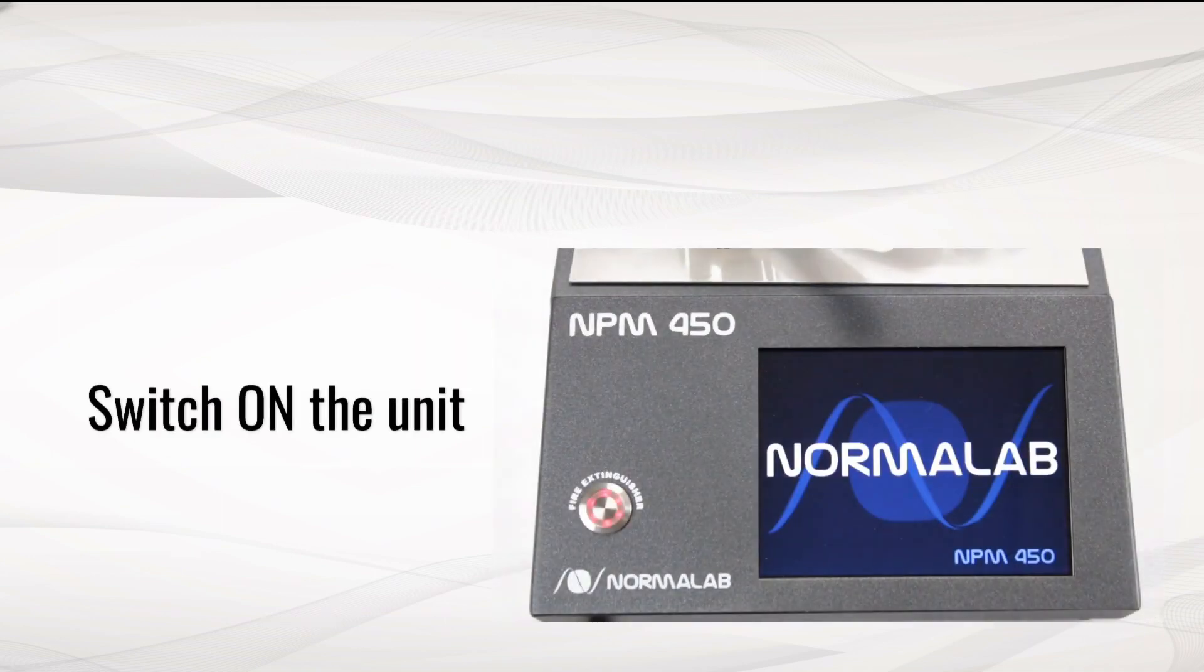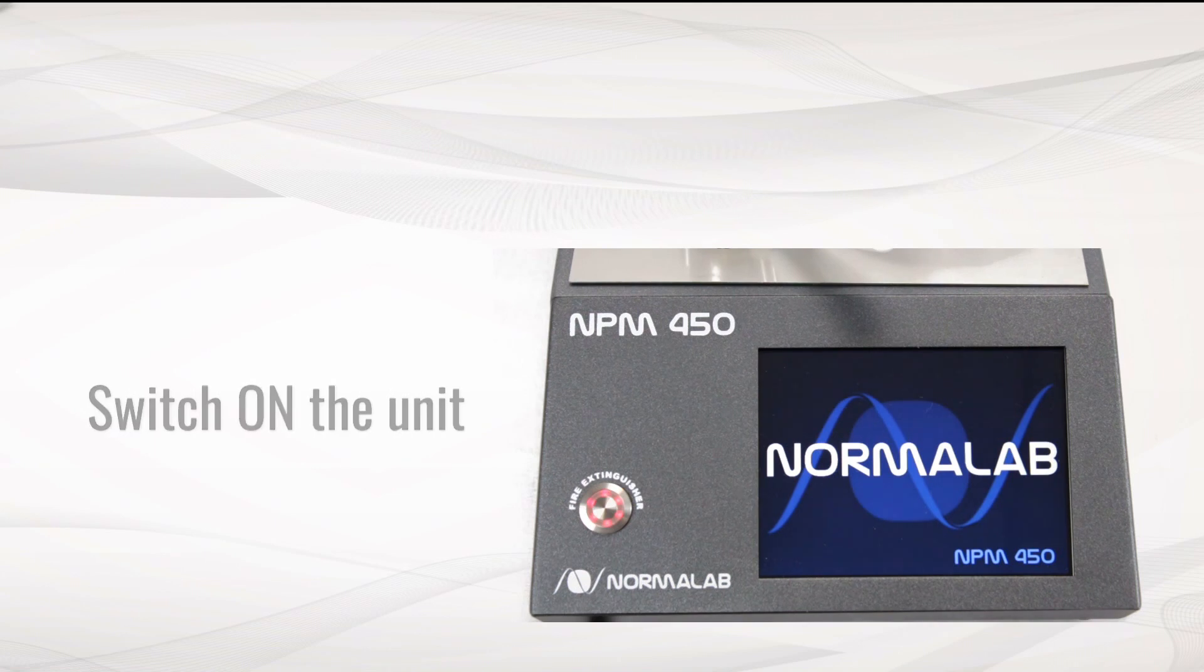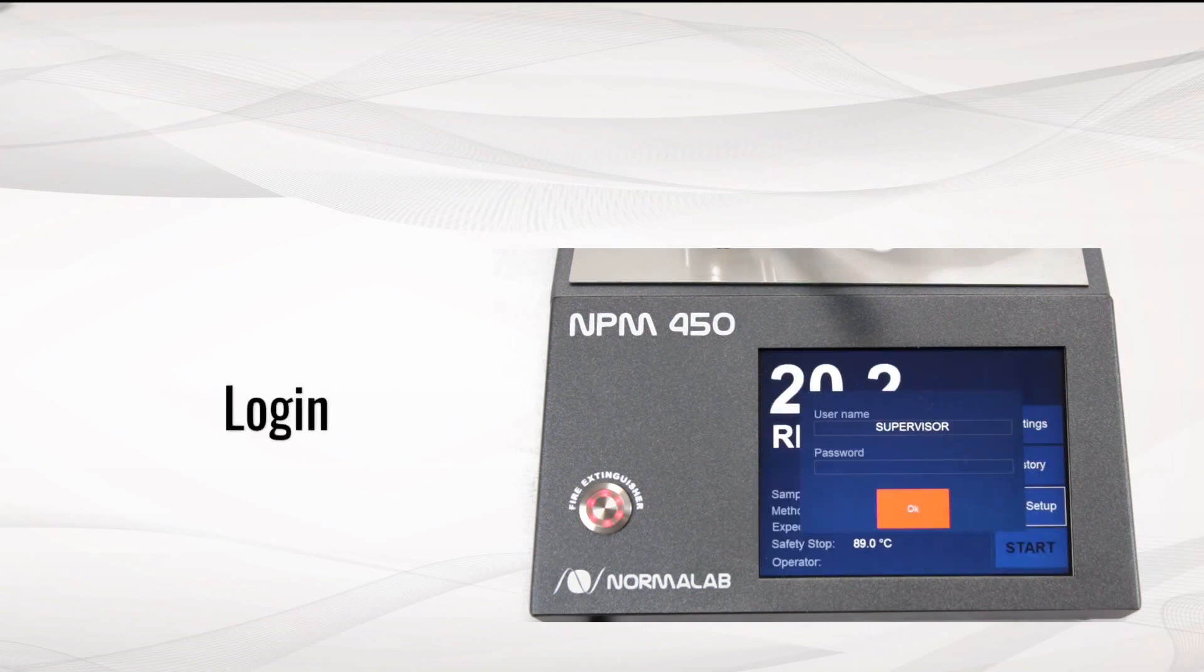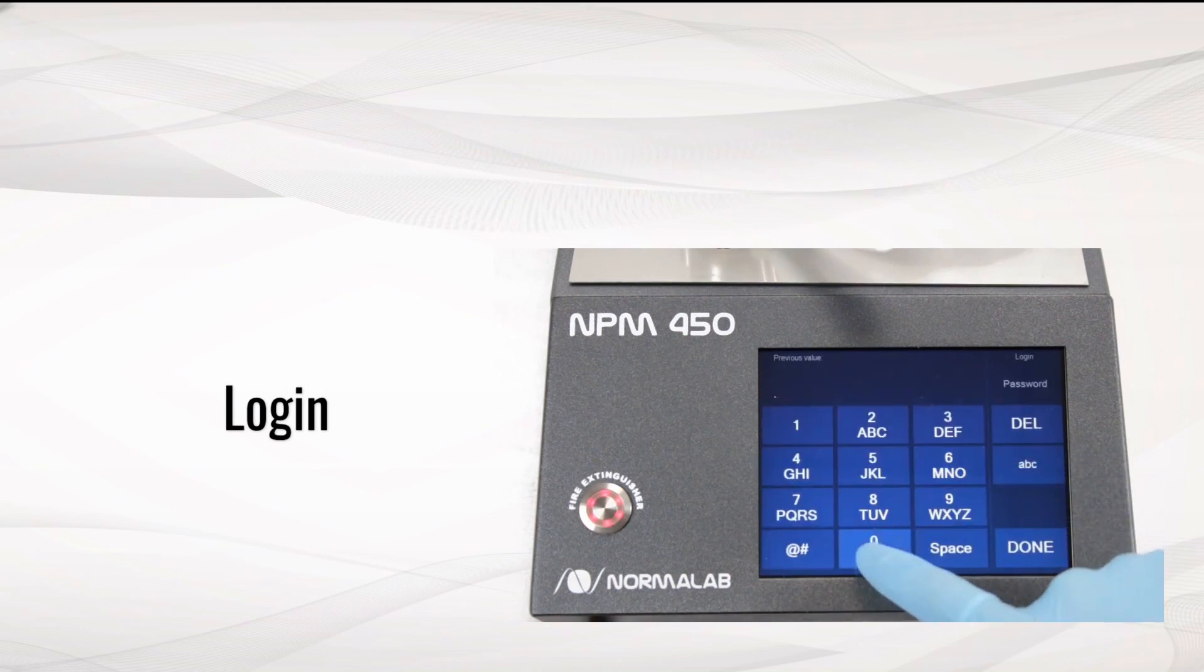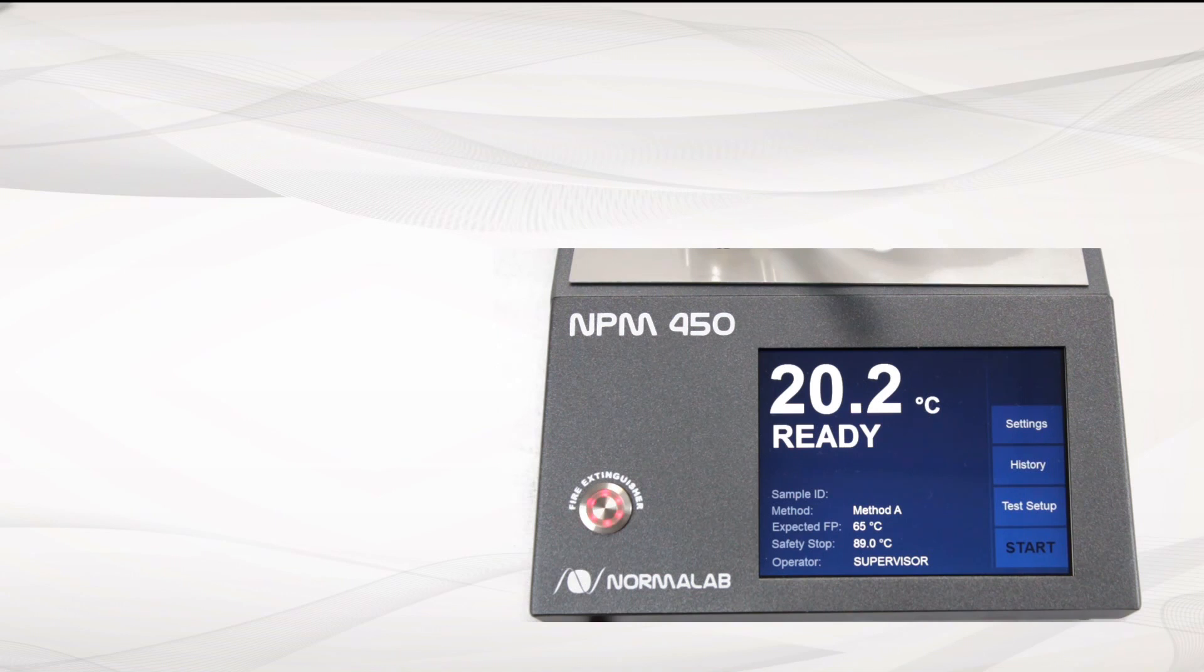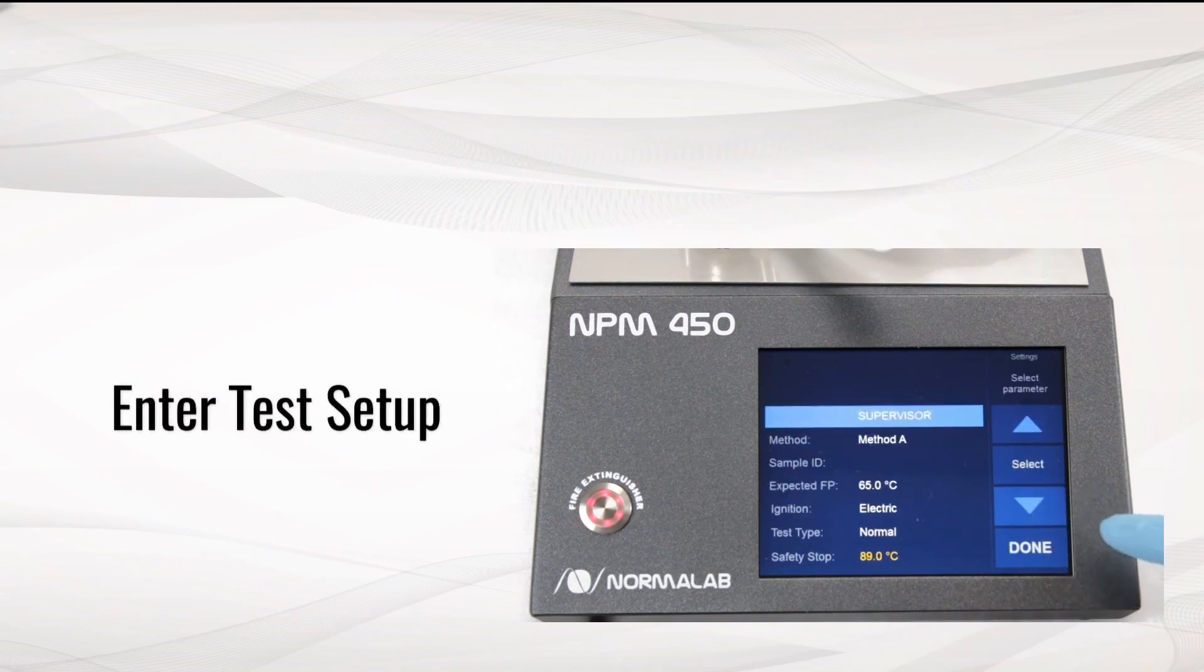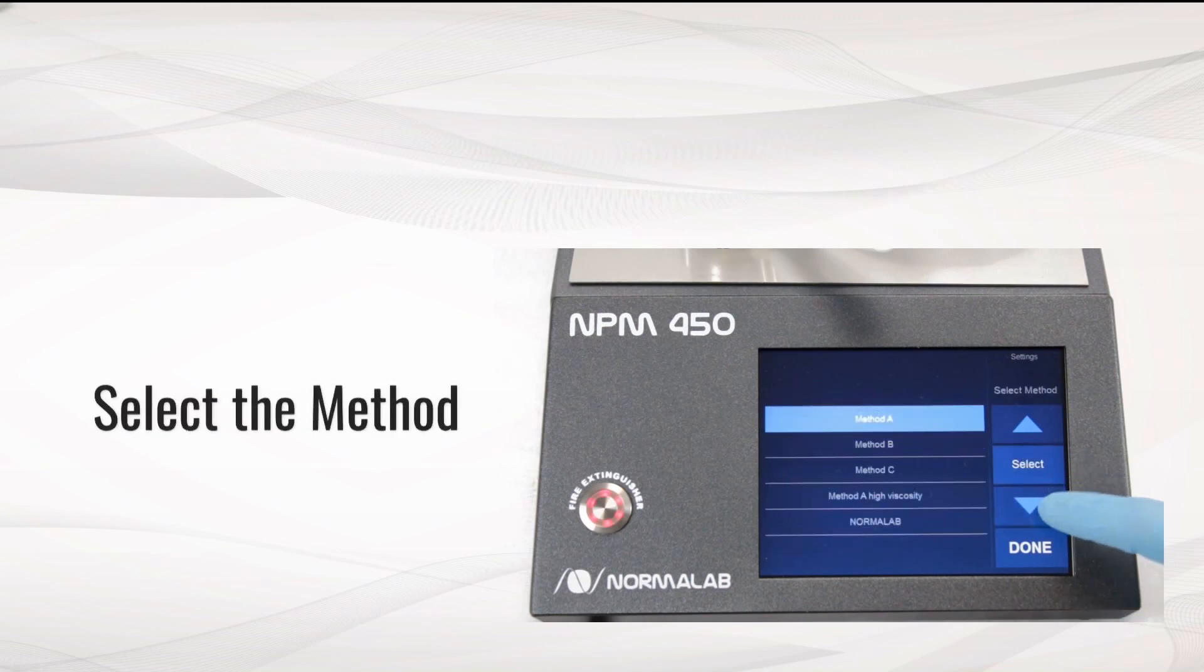Switch on the unit from the rear button. Login using your username and password. Enter test setup and select your method from the list.